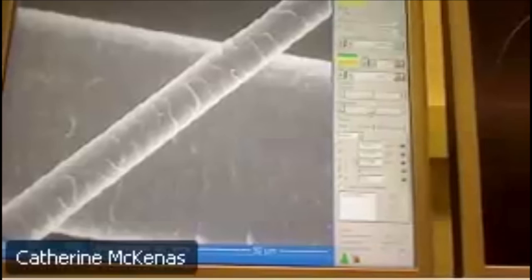I can hear you, and I can see you, and your screen as well. Great. Okay, cool. So what hair is this? Let me zoom out. So we're looking at the cat hair in front and Mr. Gat's hair in back. You can see from this image alone just how much bigger human hair is than cat hair. The cat hair is about a quarter the size of the human's hair.